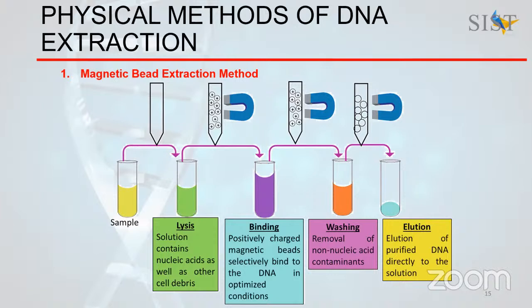Then, like in any other DNA extraction, the obtained DNA will be washed again so that any contaminant present in that solution is further removed, and the obtained DNA pellet will be resuspended in a buffer where the DNA will be dissolved. So for all these steps, likewise in the basic DNA extraction method, centrifugation is an important factor.